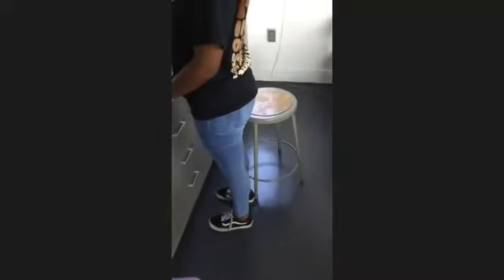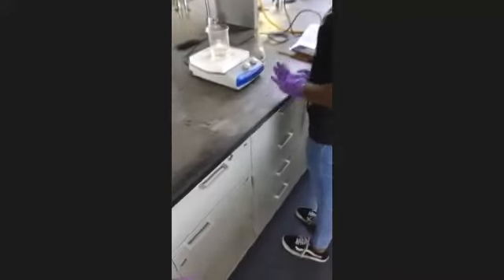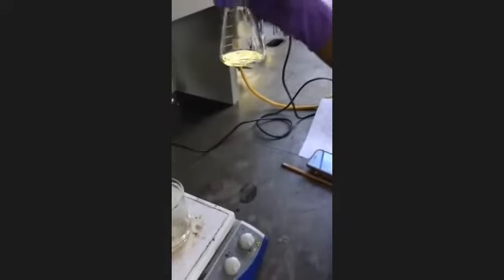Your stuff should have been done already. You can take that off. It's been longer than 5 minutes since it went clear, right? Yeah, there you go. Just sit it on the bench top. I know it's kind of yellowish, but it's good. As long as there's no solid left in there, you're good. So you can see that there's no solid left. All of your salicylic acid went into solution.